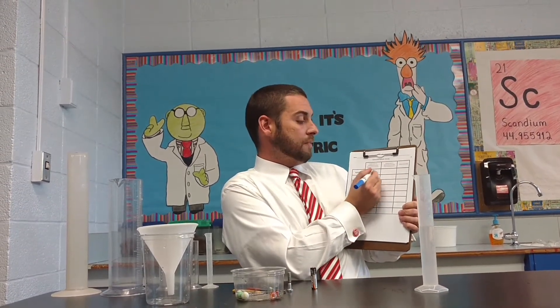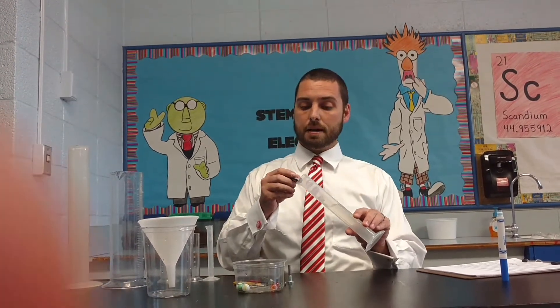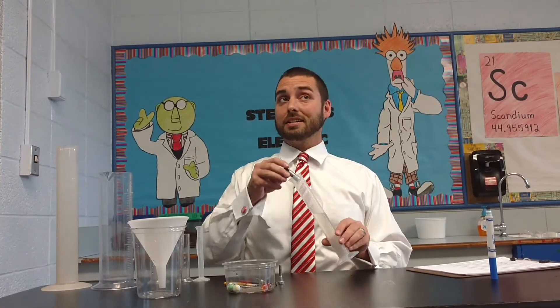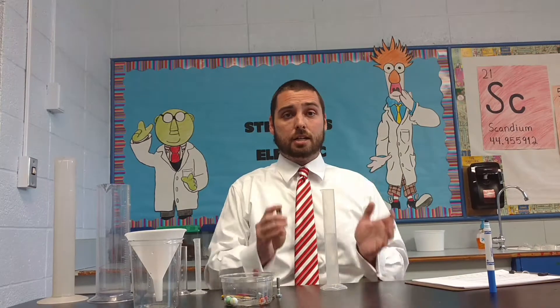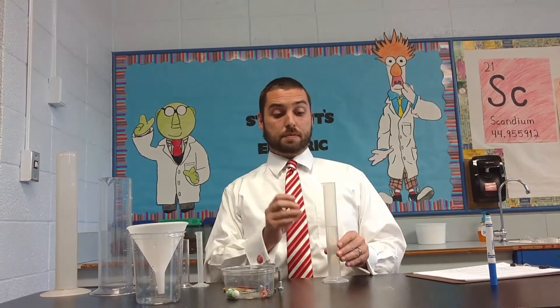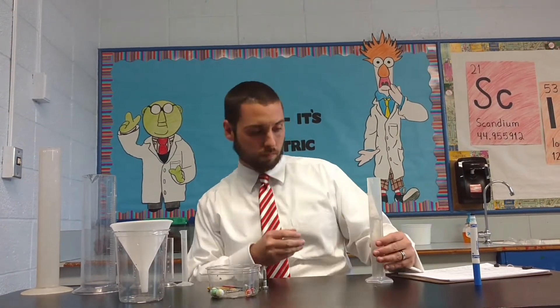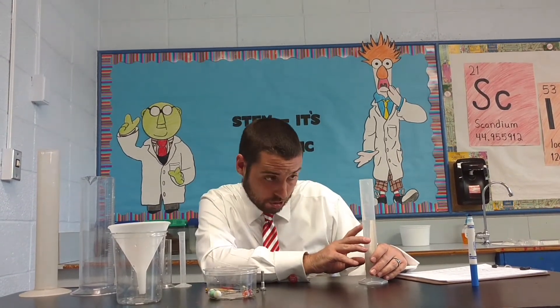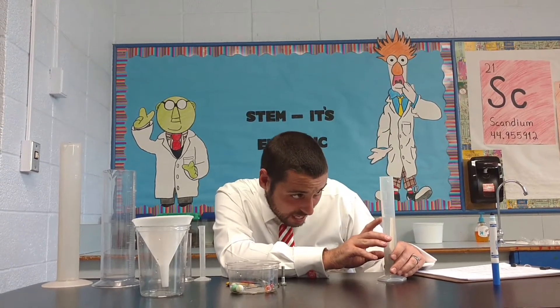I'm going to record 70 milliliters right here. Now I put my battery in. Notice what I'm doing — I take my graduated cylinder and angle it, because if I don't, I might have a splash effect and lose some of my precious water. So we angle it, creating a slide. We slide our battery in — boom. Now I check: how much did the water level rise? Started at 70, so that's 71, 72, 73, 74, 75, 76, 77 milliliters.